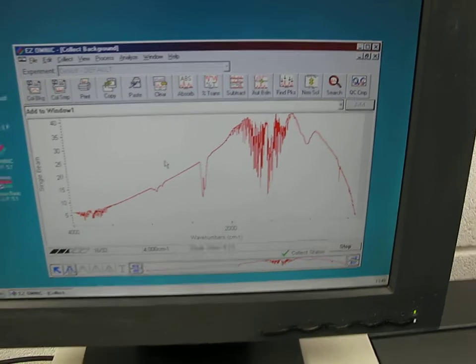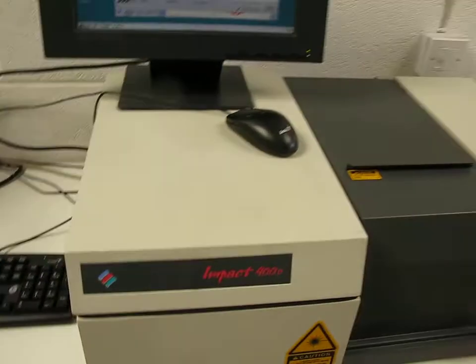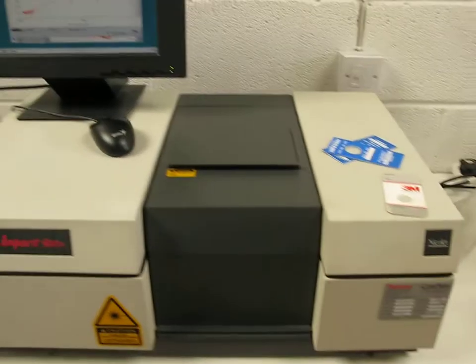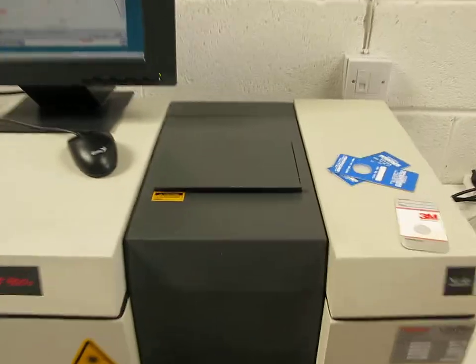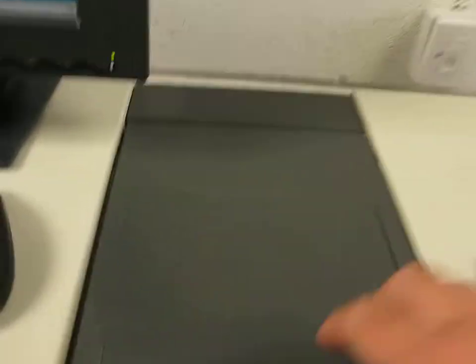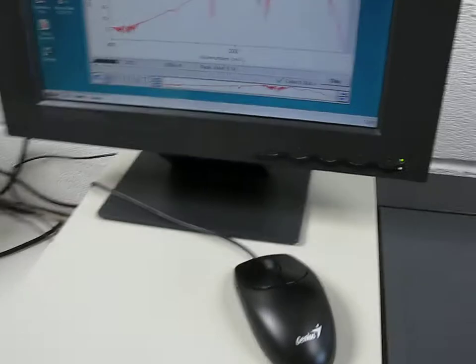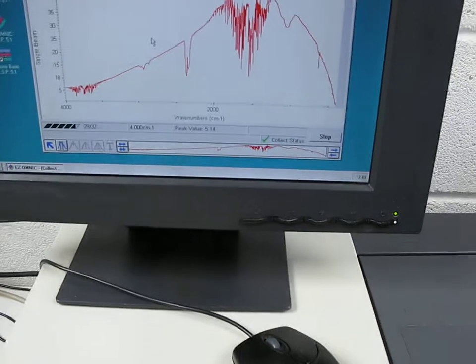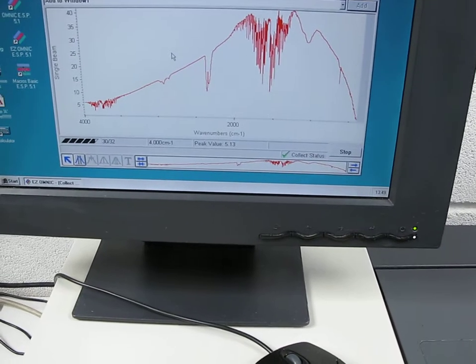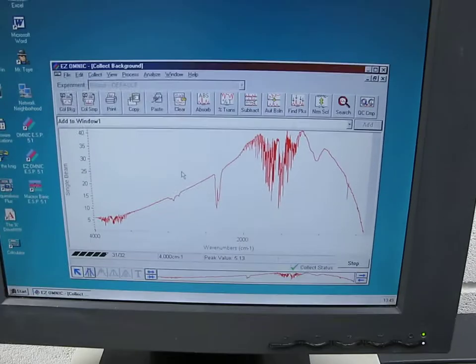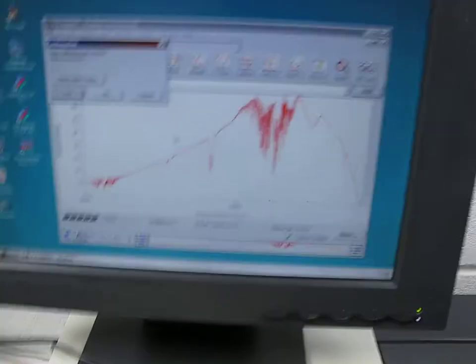You can see that, just have a quick look around the instrument in a pretty reasonable condition. Lasers in good order, beam splitter is okay.